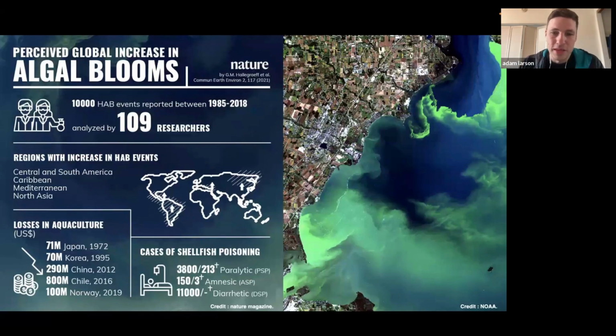And this is something well within the means of a flow-through imager. Again, if you look at the satellite image, you can see it changes very much depending on where you are. A lot of these surveillance initiatives are limited by the personnel to sample the water as well as the instrumentation to actually look at the water. So if we can get more instruments out there, looking at geographically more spots, and enable the community to do their own monitoring, we can do this in a much better way and let people know where these blooms are happening, to warn people well ahead of when they're going to get sick from these algae accumulating in the shellfish or fish.